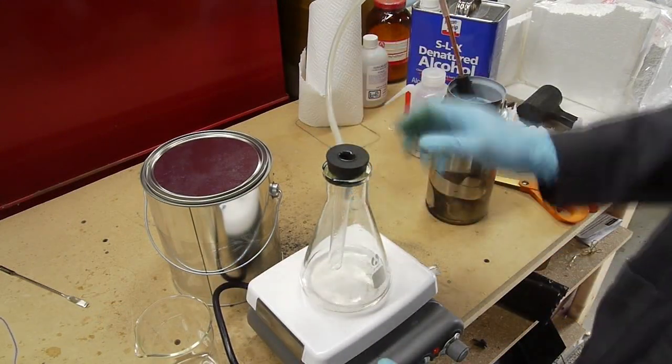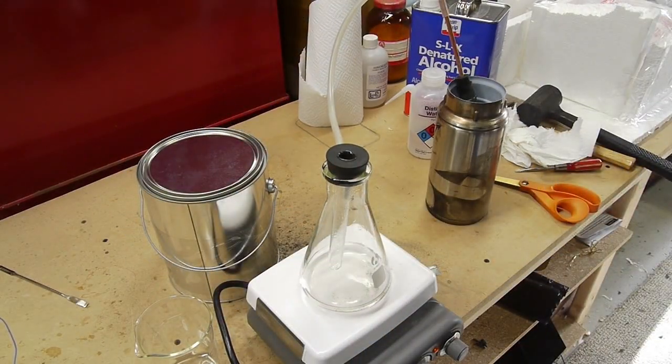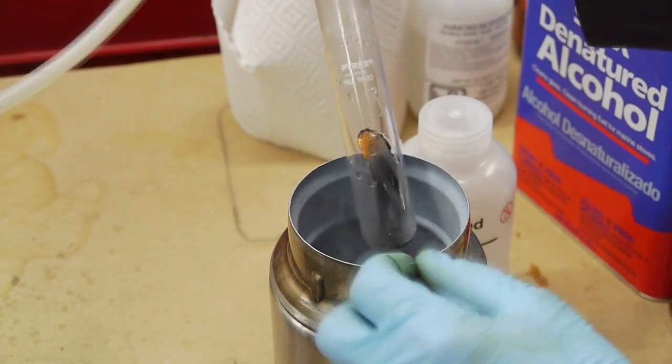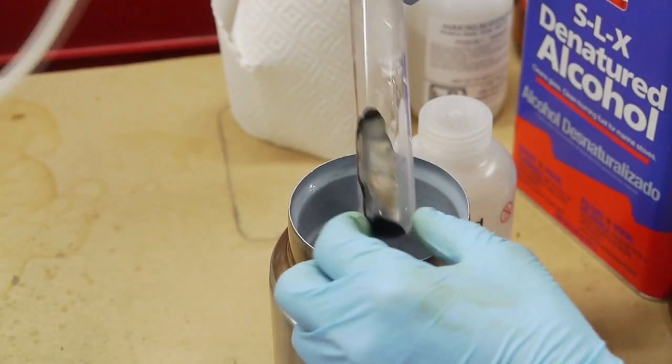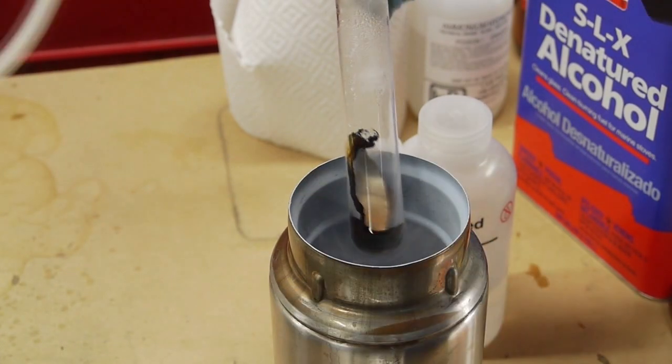So the ammonium hydroxide is about 30% ammonia by weight, I think. And when you heat it up, the ammonia gas comes off of it. So this is hardly purely anhydrous. The ammonium hydroxide, when you heat it up, also lets off a lot of water vapor.